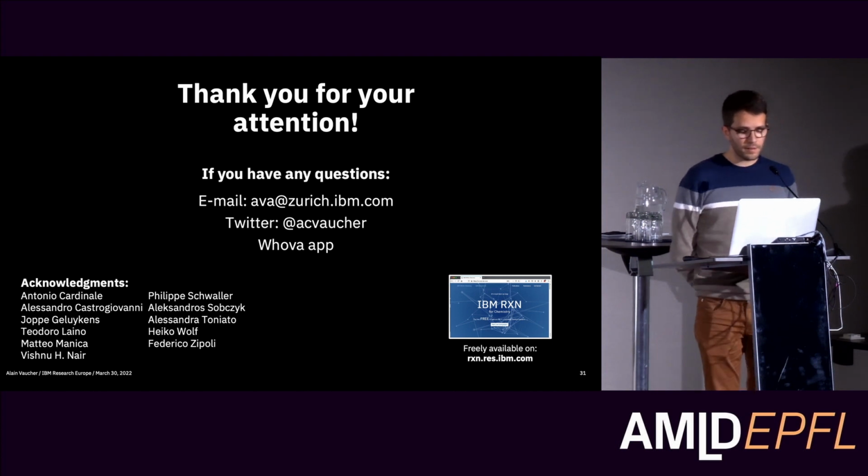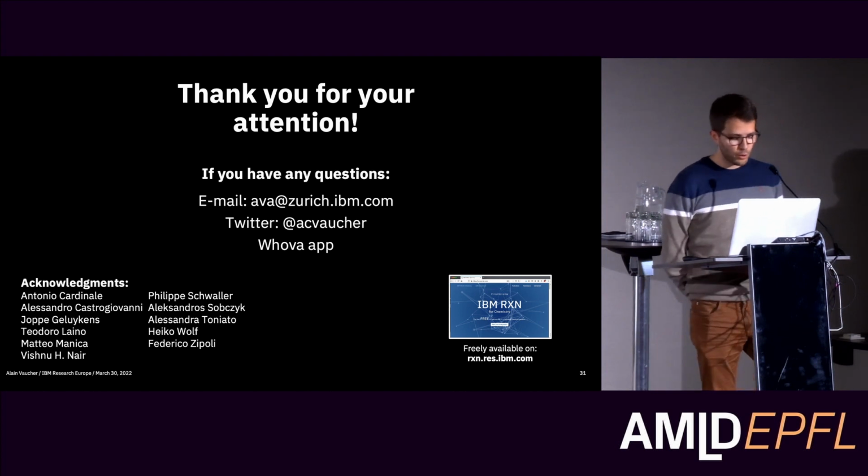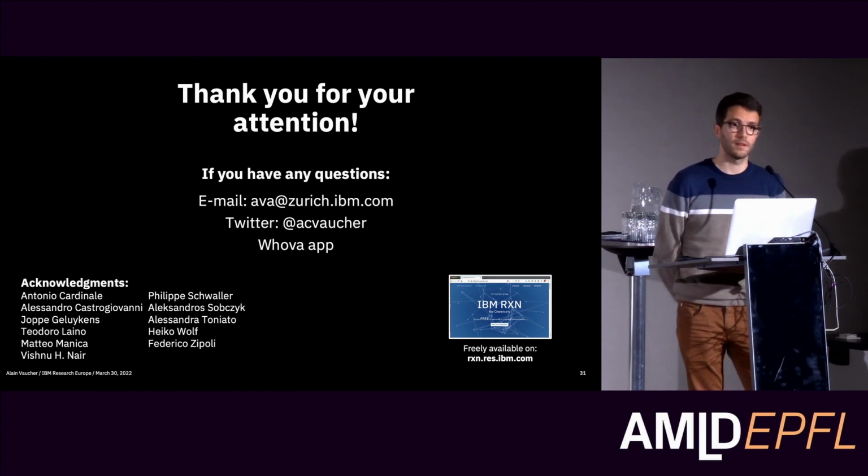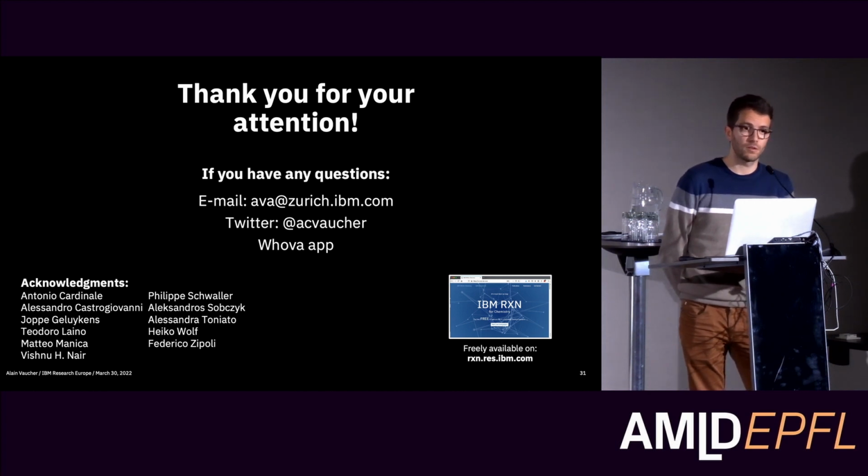It's a very good point, and so two answers. So first, it is always a good idea for the chemist to check the actions before launching the execution, and this is commonly what we do. The actions, usually from what I heard from my colleagues, they are a very good starting point, and then this can be improved. Then it is true that sometimes the reaction doesn't work out, and this is as you would experience, just what you were saying, that even though you follow what seems to work from the literature, the reaction doesn't work.